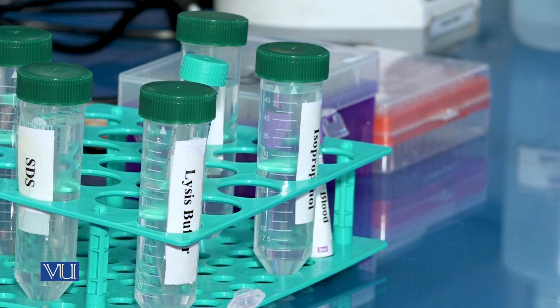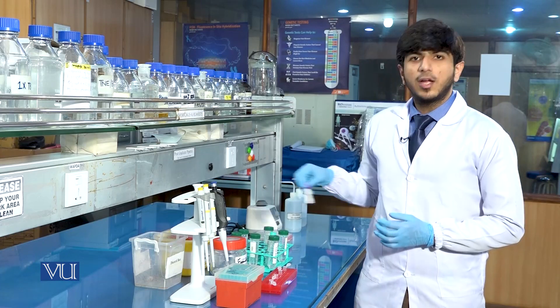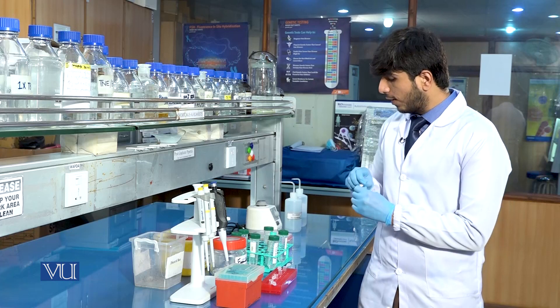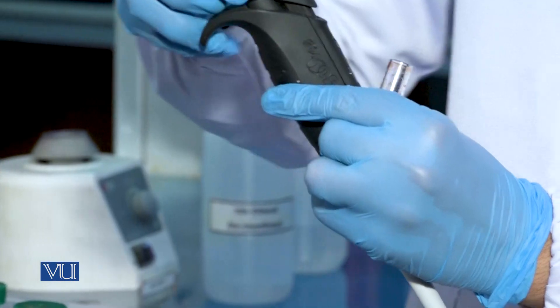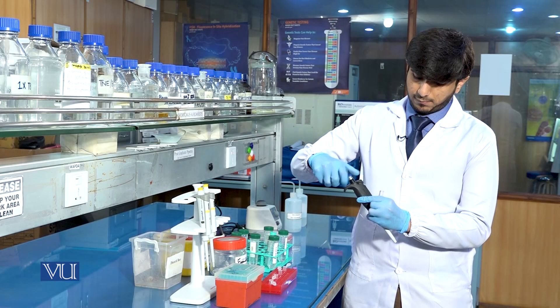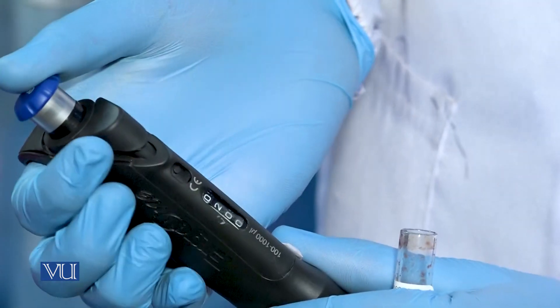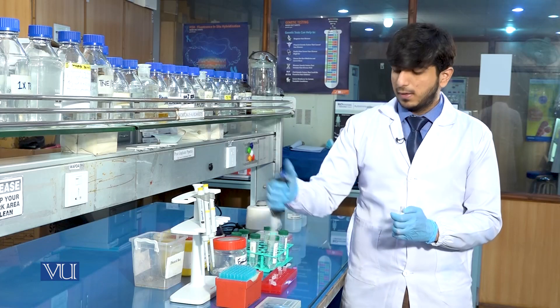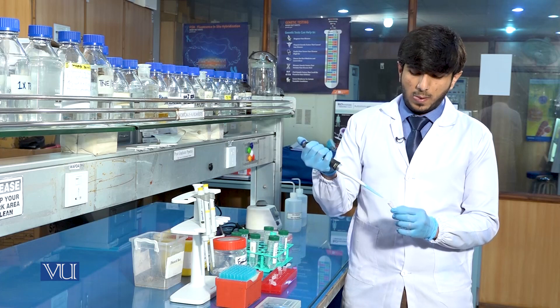First of all, we will take the sample to extract the DNA, and the sample that we have is the human blood sample. We will take 200 microlitres of human blood.